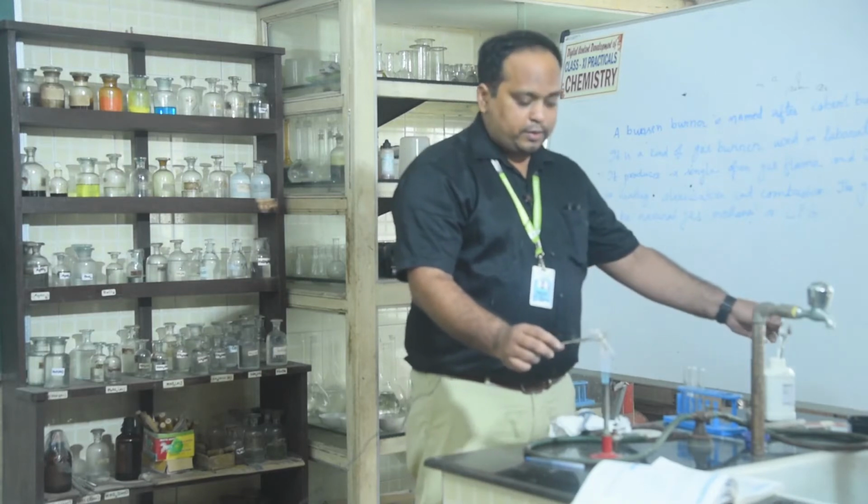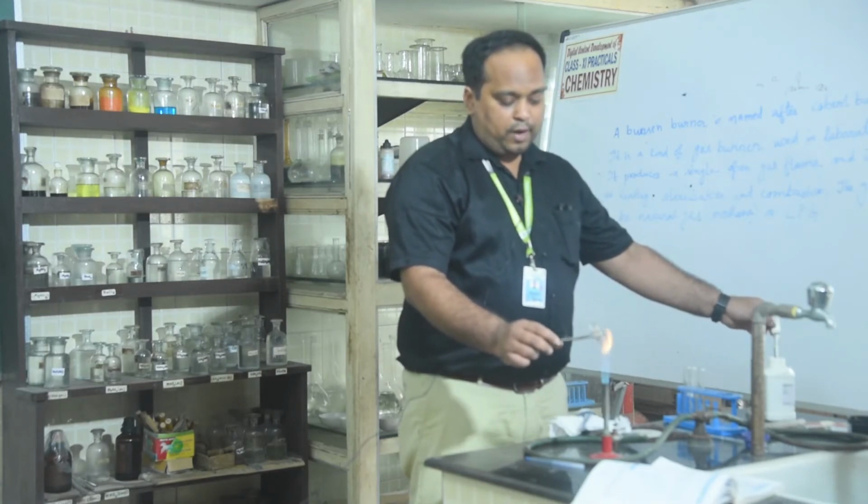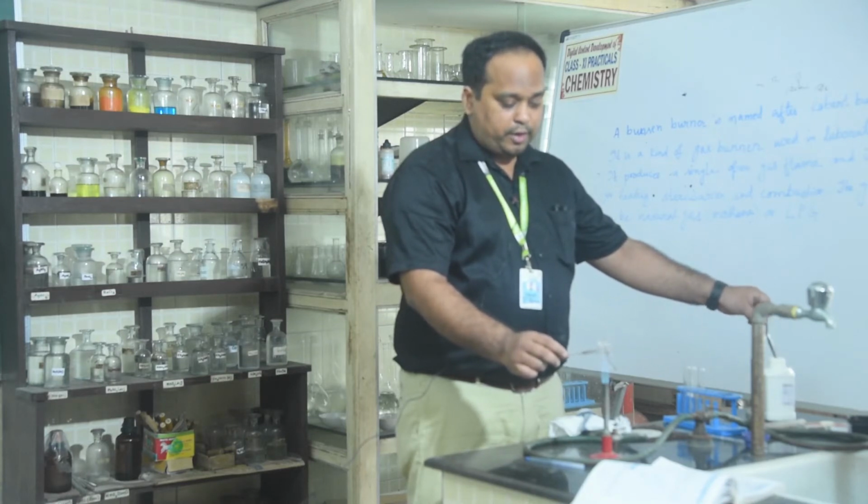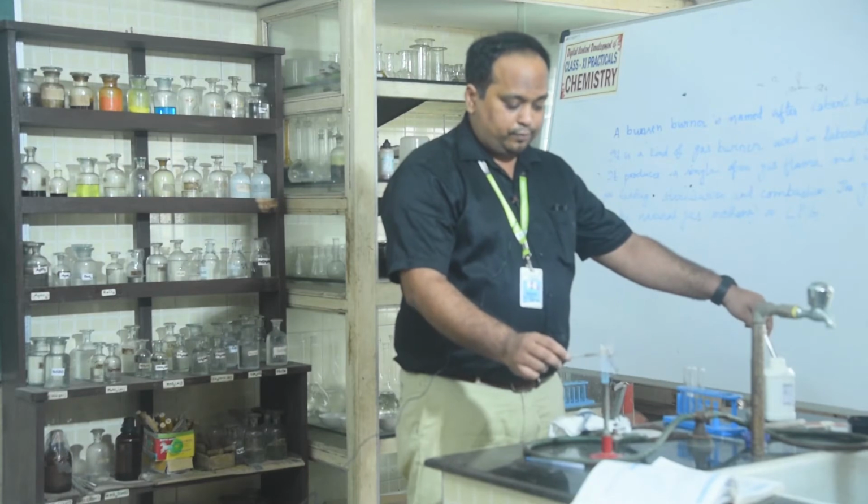Okay, so we will take some amount of the salt. I am not telling you which salt it is; I am just taking it, then you can find out what it is.